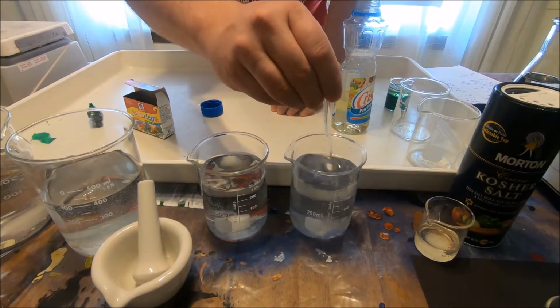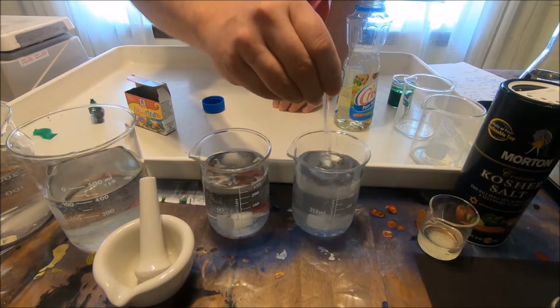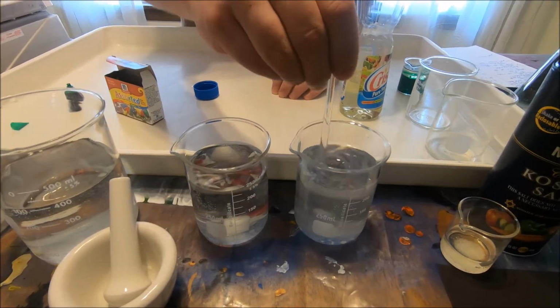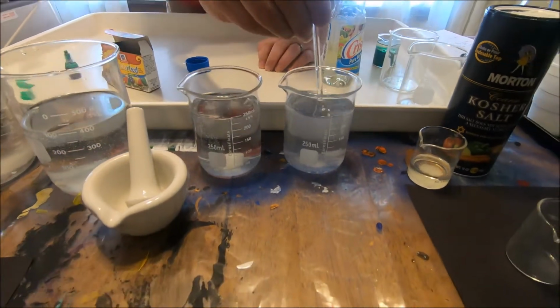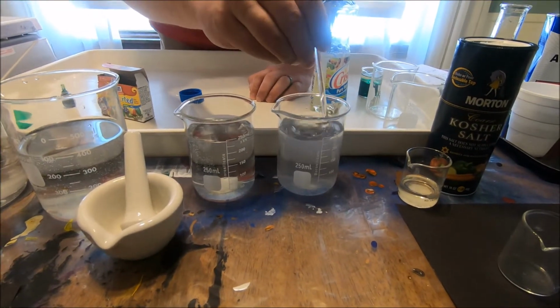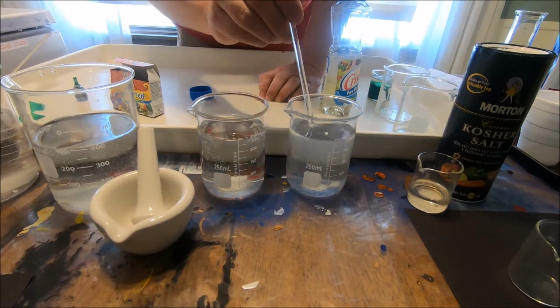The more contact we can have between the solute and the solvent to make our solution, the faster it will dissolve. So stirring, agitating, shaking up, anything like that allows for a much quicker dissolving rate than if we just keep it sitting there by itself.